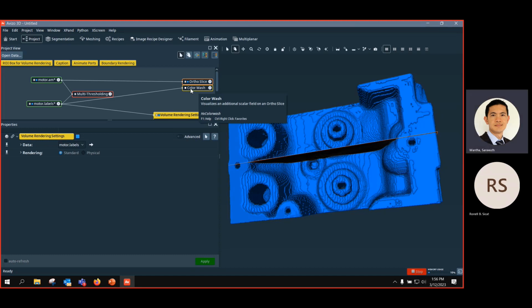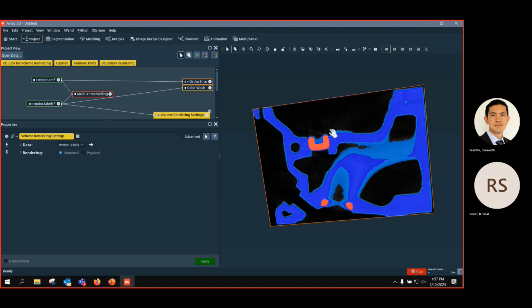Yeah, so it depends on your subjective judgment of what the intensity of your materials should be, because in the example you can quite easily see that, let's say, over here. Could be, but in general you just look by eye and then you see the difference, or you know from your background research that some parts are brighter than others. It depends on the characteristic of the material, but it's not very precise with this value. It depends on how you would like to separate them accordingly.